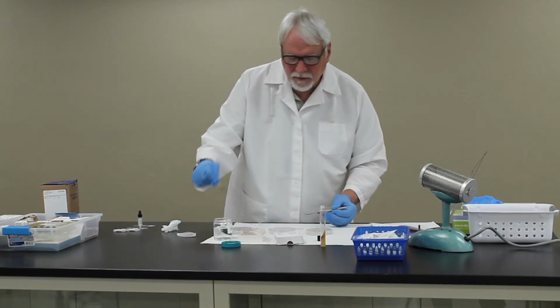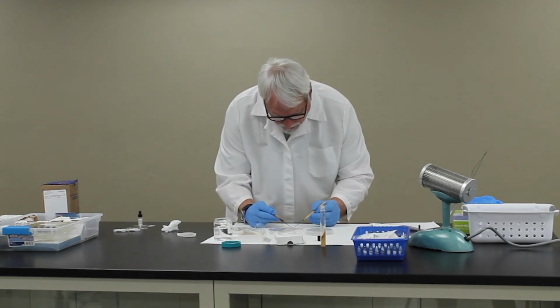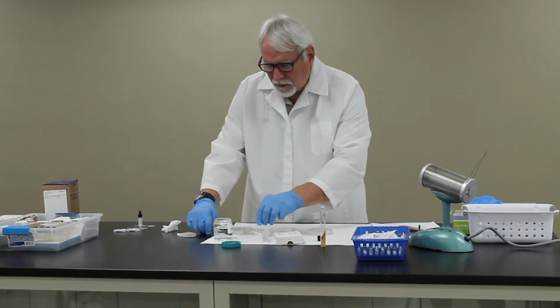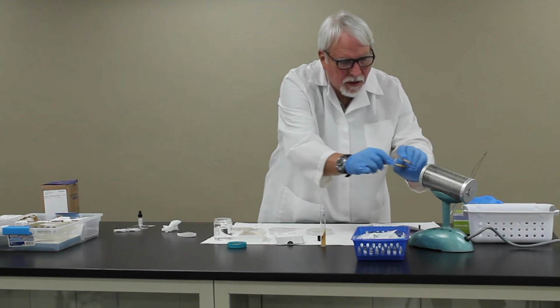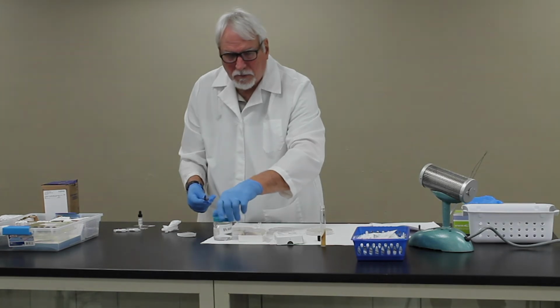And you'll take the other probe and you're going to tease that back and forth on the slide until you see the individual hyphae being spread out where you can look at these under the microscope. So once you've made that slide, you'll be looking at it under the microscope, and you'll be looking for reproductive structures, which we will have depicted for you in still shots on Moodle.